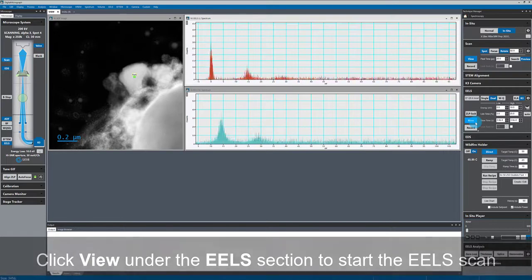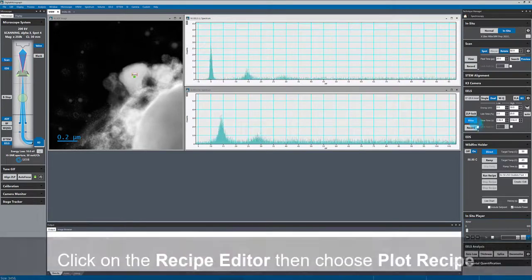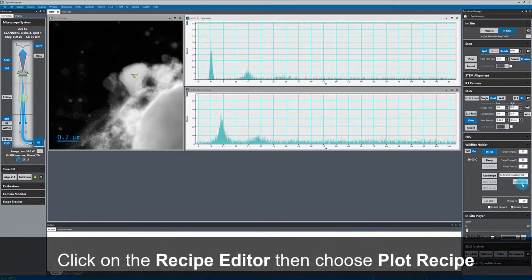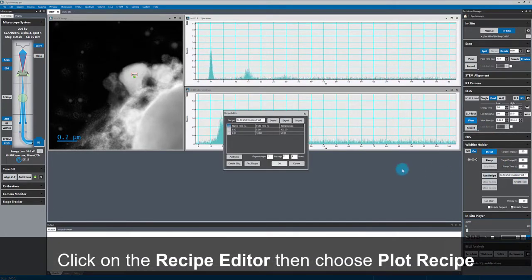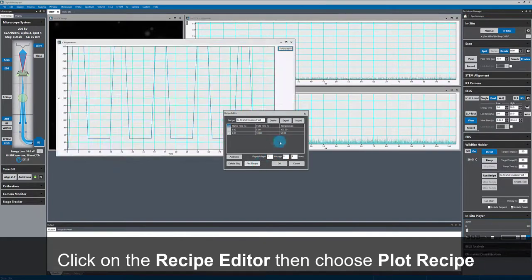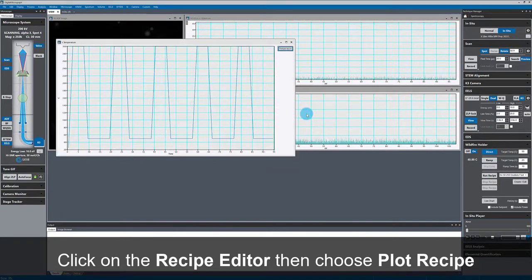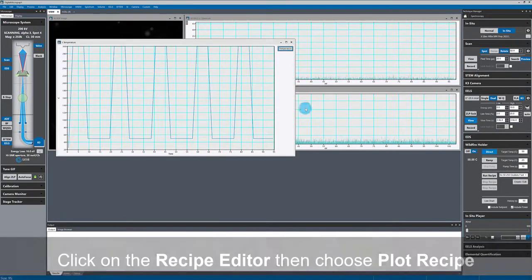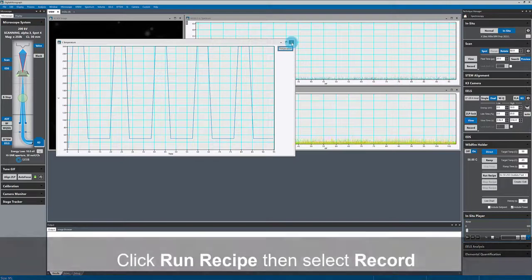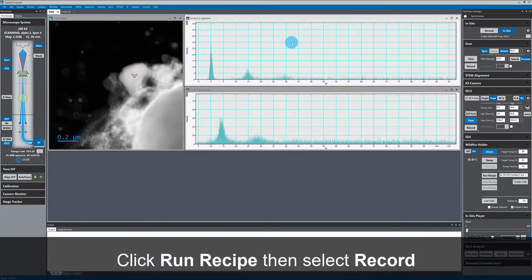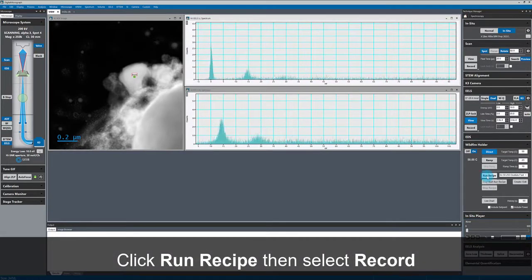But now that my scan is stopped, I get data from a single location where the beam is parked. Now I'm showing the temperature recipe that I already had saved. I'll run that recipe and hit record in the EELS acquisition pallet.